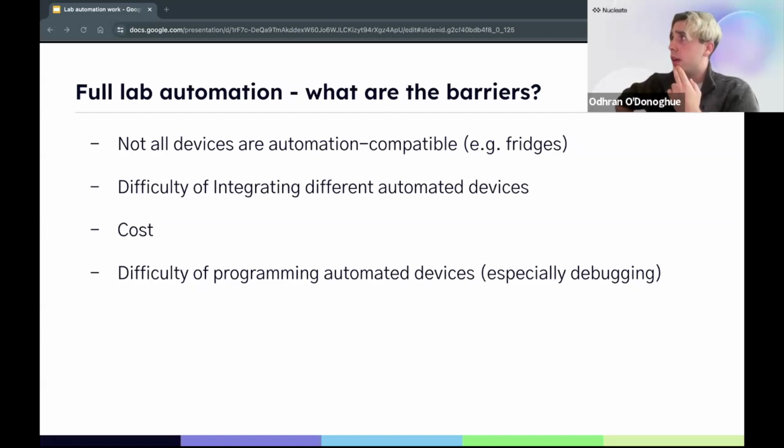Finally, and I think most notably, there are difficulties in programming robotics. When you have to control every single component of an experiment, humans aren't really used to thinking in that way. It's one of the reasons we have a lot of errors in science, but it's also one of the reasons we can have serendipity and do this sort of discovery. Writing scripts for robots to do science is a hard task.